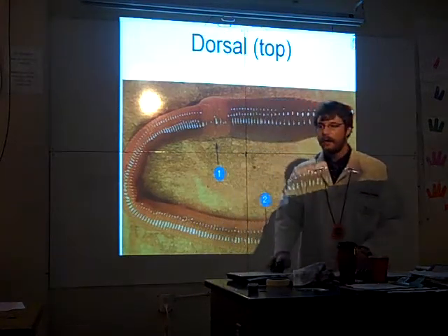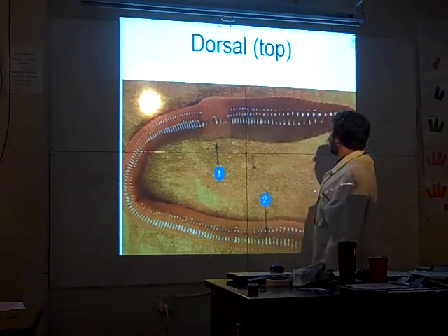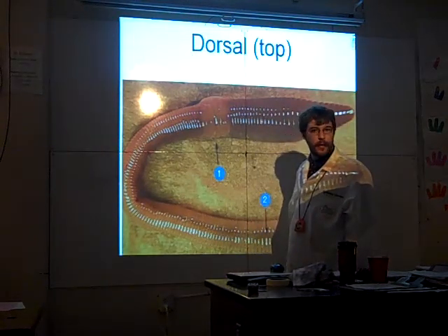You're going to make your cut on the dorsal side about 2 centimeters past this structure here. This is called the clitellum. You're going to start at the mouth. You're going to cut it all the way down here. Once you hit the intestine, the rest of the body's all intestine, so there's no need to keep going.